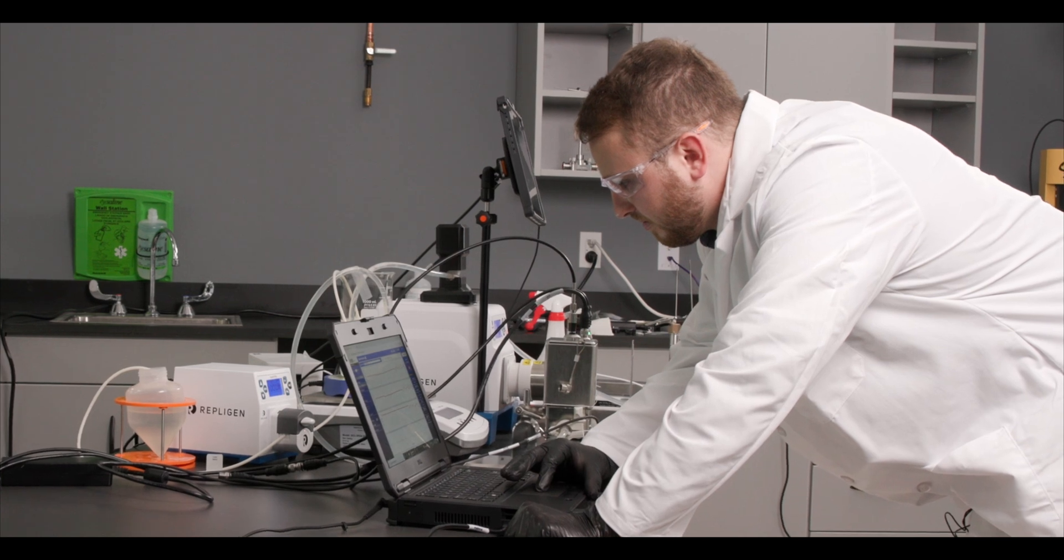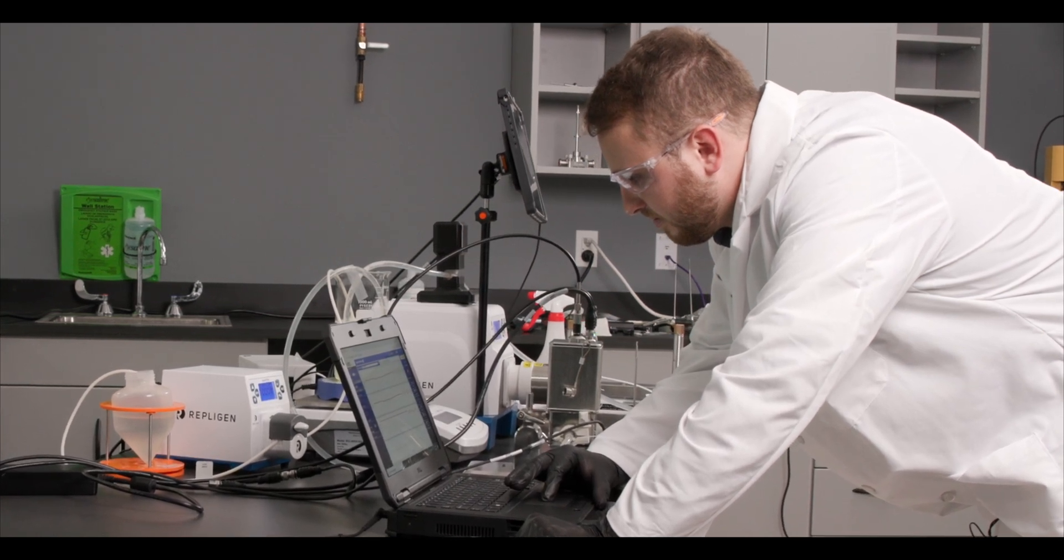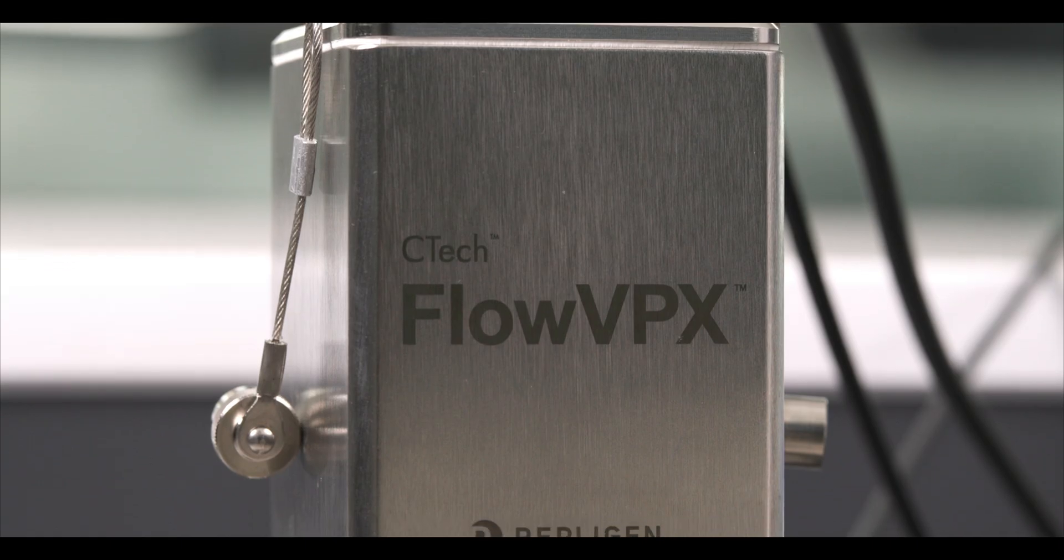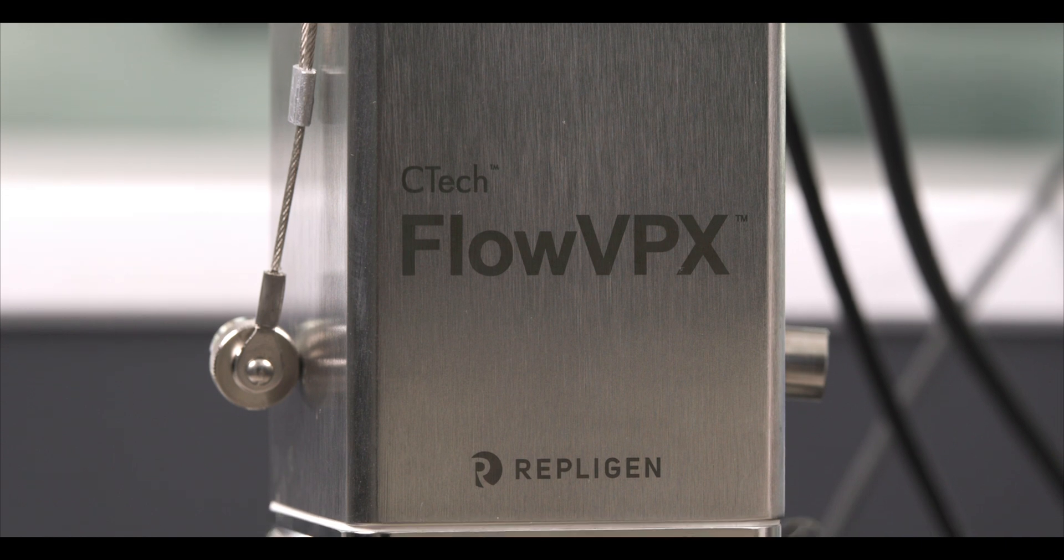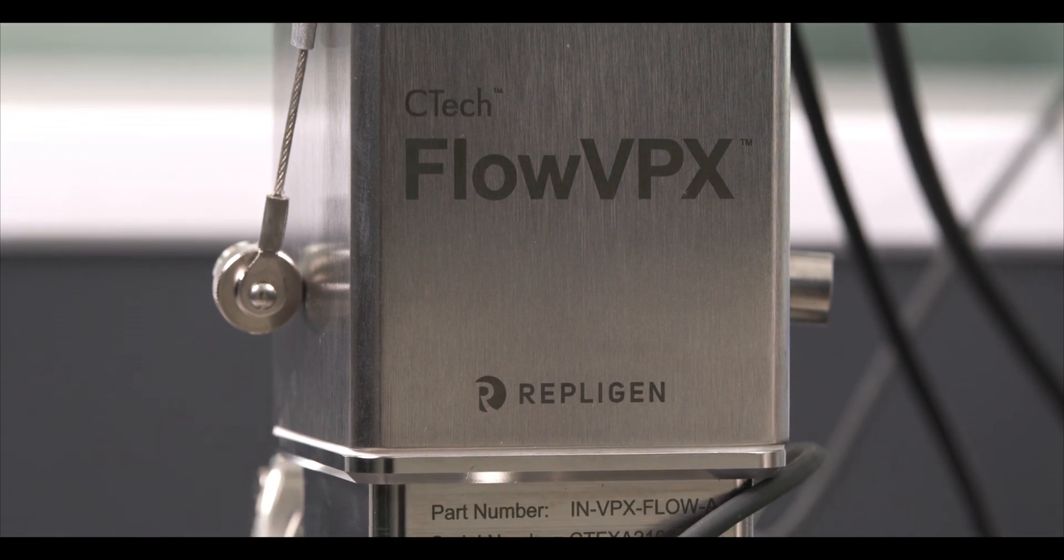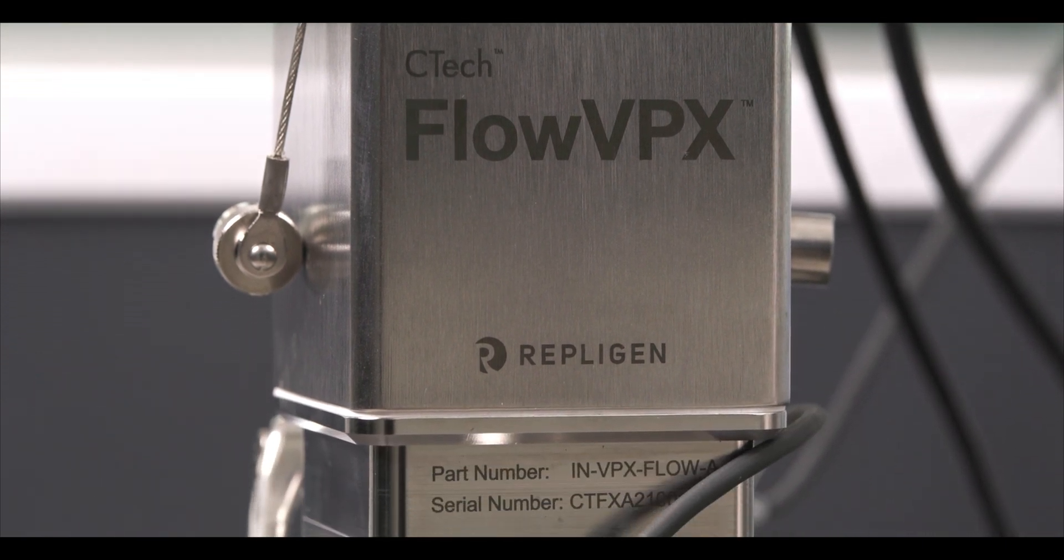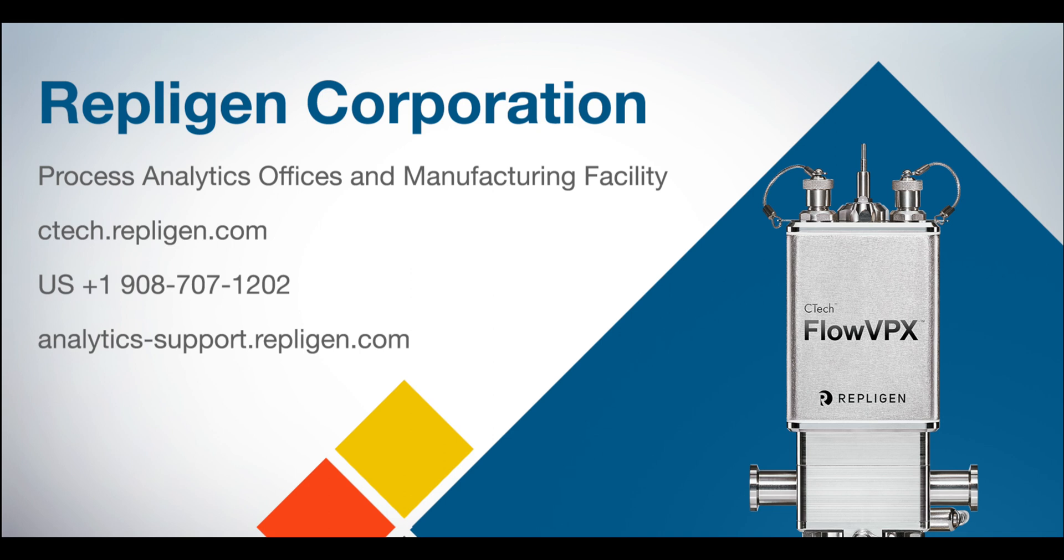And there you have it. With the FlowVPX system performing inline bioprocess analytics is easier than ever and has a measure of accuracy that can't be beat. To discuss more options and what's right for your process reach out to ctech.repligen.com or through our call line.